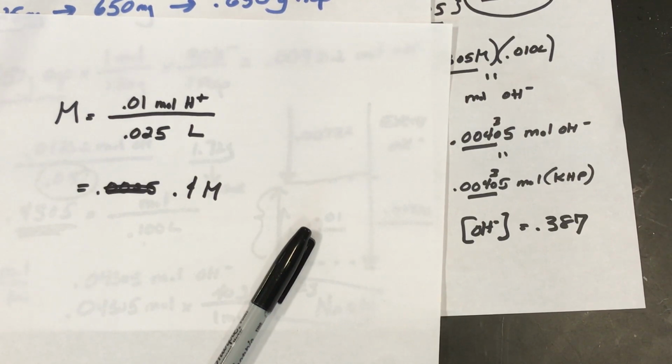We wear gloves in this lab because that sodium hydroxide, if you get it on your skin, it can irritate your skin. I got some on my hands, and I wiped my temple, and my temple is irritated.